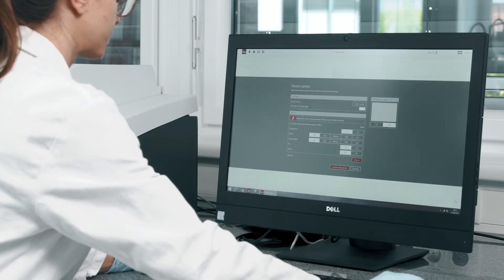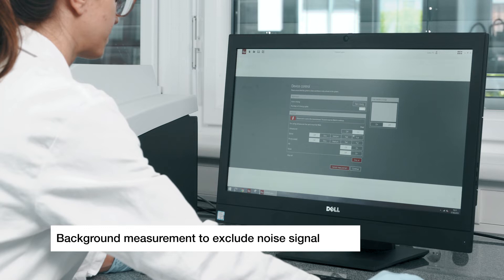Before the sample measurement is started, the background is recorded to exclude the noise resulting from the carrier liquid.